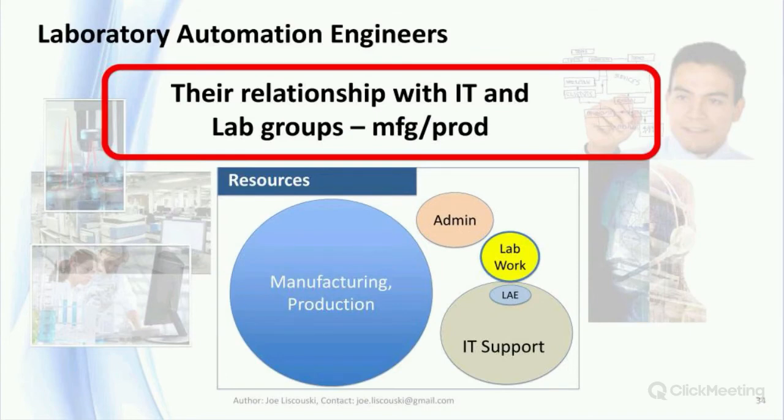In manufacturing production organizations, the LAE would be at best part of the corporate IT organization, and even there possibly as a part-time effort or completely outsourced. In this situation, the lab's management is going to have to make sure any user requirements that are developed have strong positions and justifications for its needs to help ensure that the needed systems are put in place when they're needed and with the necessary functionality.